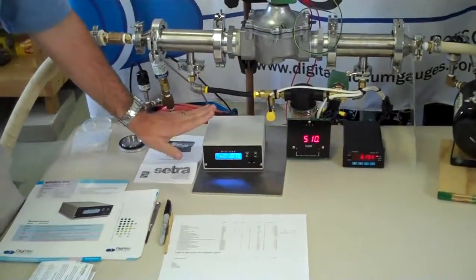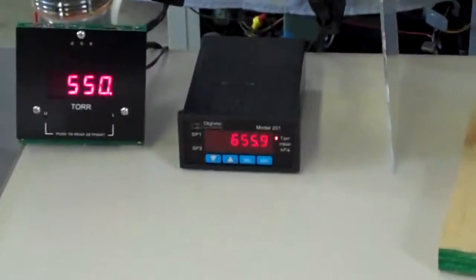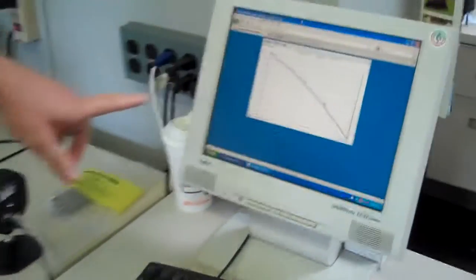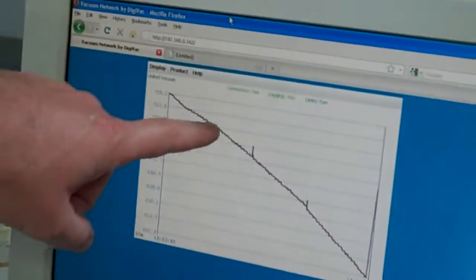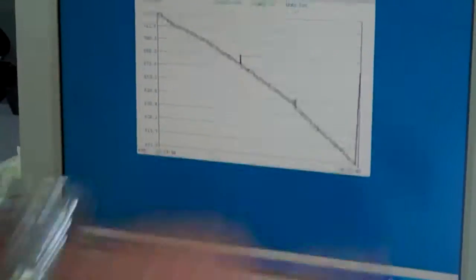This is an example of a few of our products, our 801BW and our Model 450 working in tandem to achieve this end point customer need. Before this, my understanding is the customer actually would use valves to achieve this kind of ramp rate. Just to let you know what we're doing here, we have another device, our Model 201, and it's actually measuring the vacuum as it goes up and comes down so we can actually graph it. If we were to look over here on our computer monitors, this is actually logging to a web browser, you can actually see that we're coming down nice and easy at that 168 torr per hour rate, and now that we're bleeding, of course, we're coming back up.